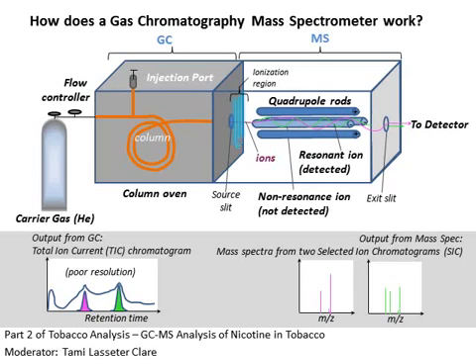And so within the mass spec software, you can input specific mass-to-charge ratios that you're interested in. In this experiment, we ask you to collect data on 4 of those, the peaks at 102, 129, 133, and 162, which are the parent and fragment ions of nicotine and quinoline.